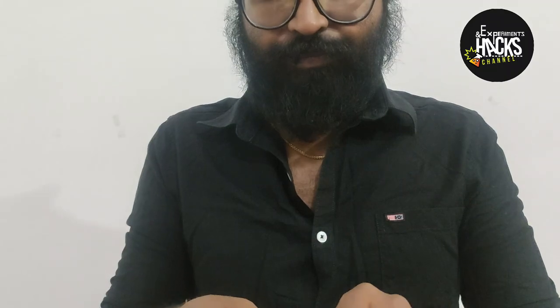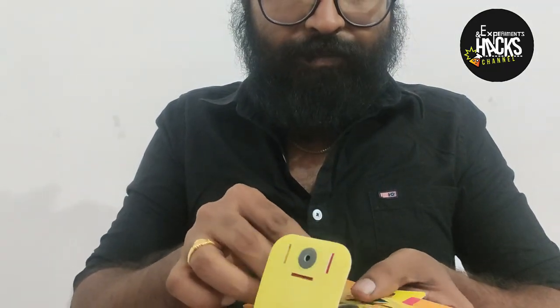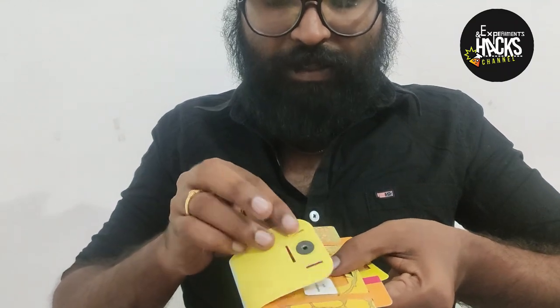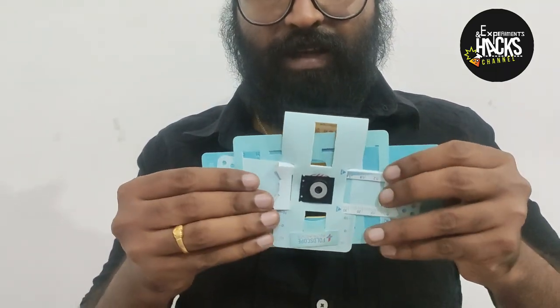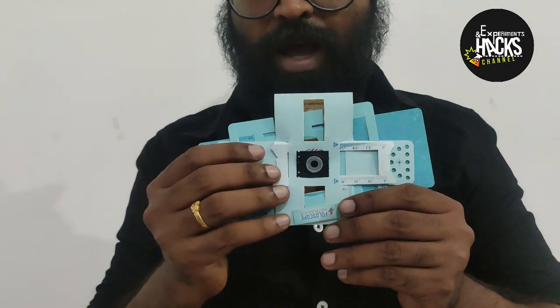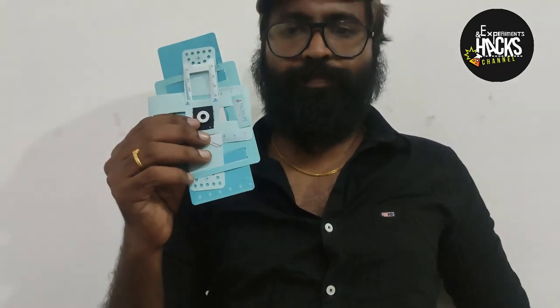This didn't change because so many health workers are used to it — standard stains remain the same for different diseases. You just pop it out and put the sample in. A magnet is attached to it, and it has an X-axis and Y-axis to adjust it. It also has a focus lens which can be adjusted by micron strips. This is a rugged device — you can jump on it, you can sit on it. It has been tested by throwing it from the third floor. The current price is one dollar and four hundred rupees.